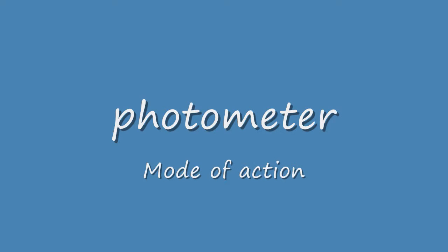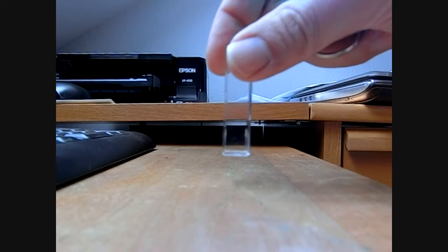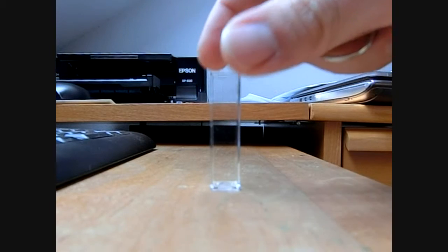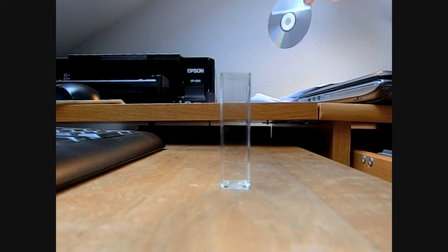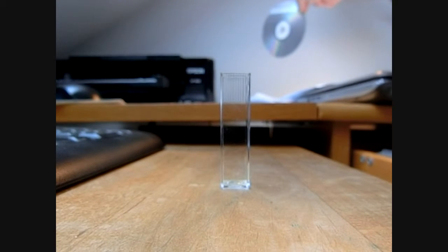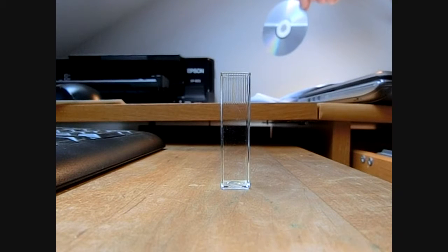Hello, I would like to show you how a photometer works. As an integral part of a photometer, you usually have a cuvette where you put your substance in, and you have a light source. As you can see with the CD in the back, you can easily diffract light into different colors.